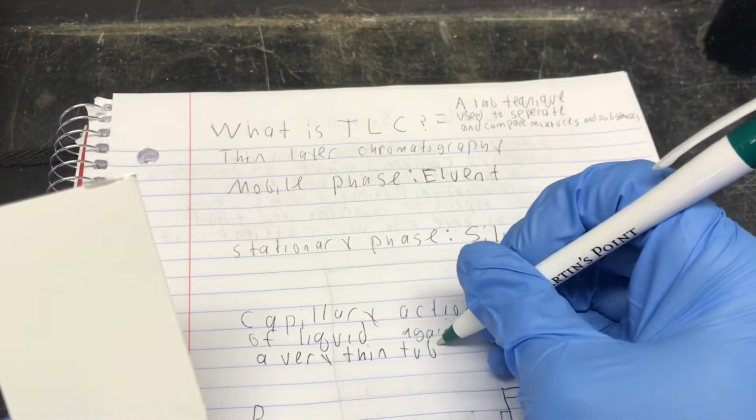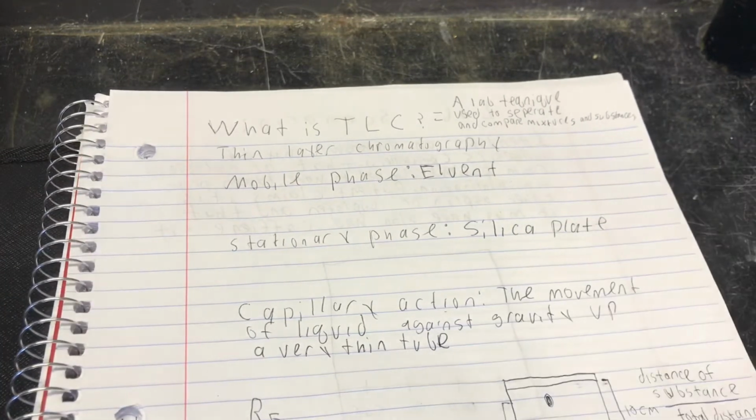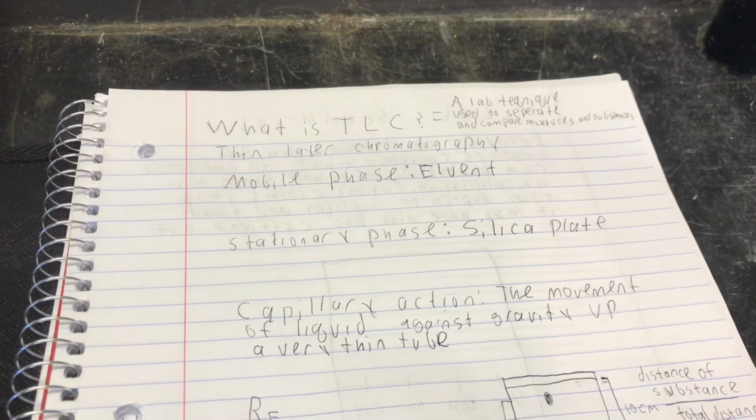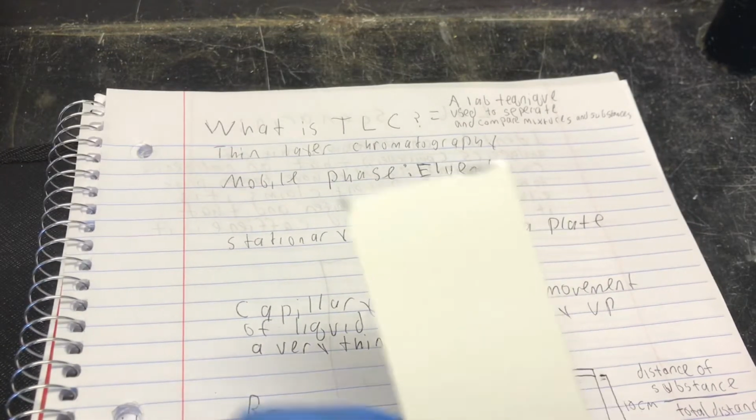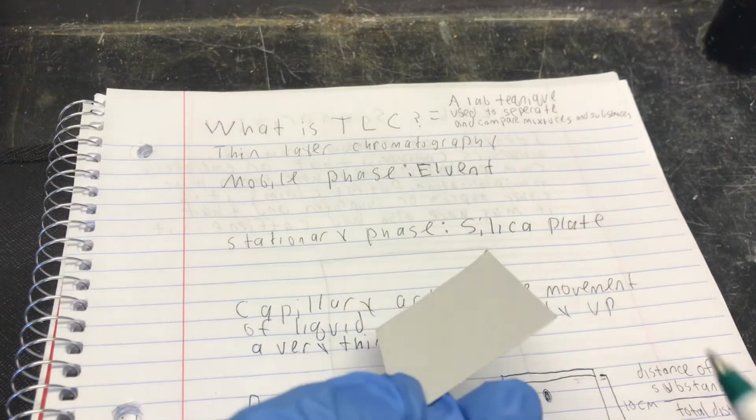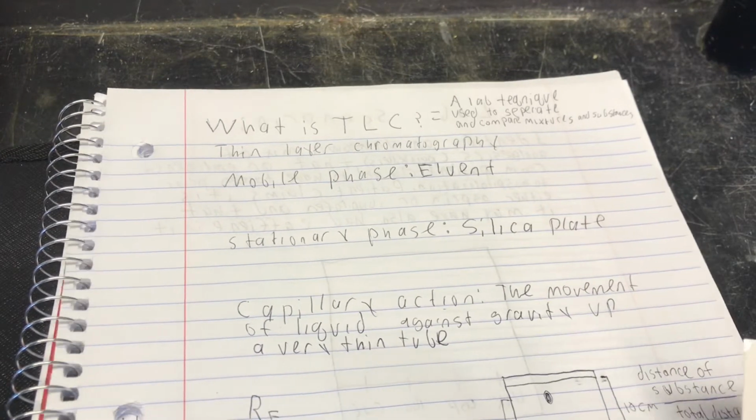I'll call it a tube. It's a little bit more than that in general in terms of what capillary action actually is, but in our case, we can think of it as the liquid going up the plate, kind of through a tube.